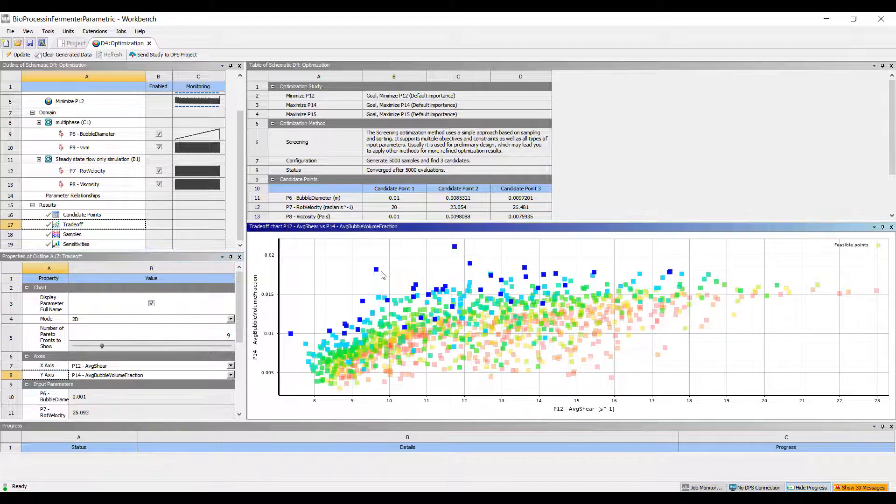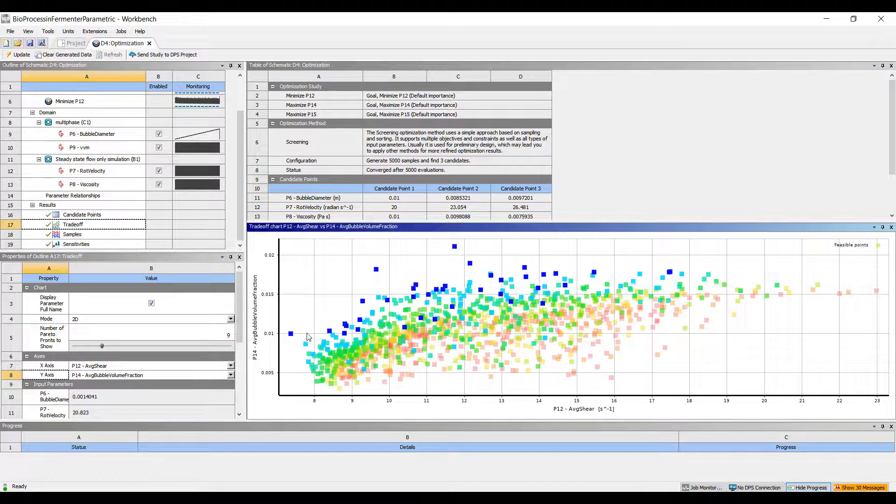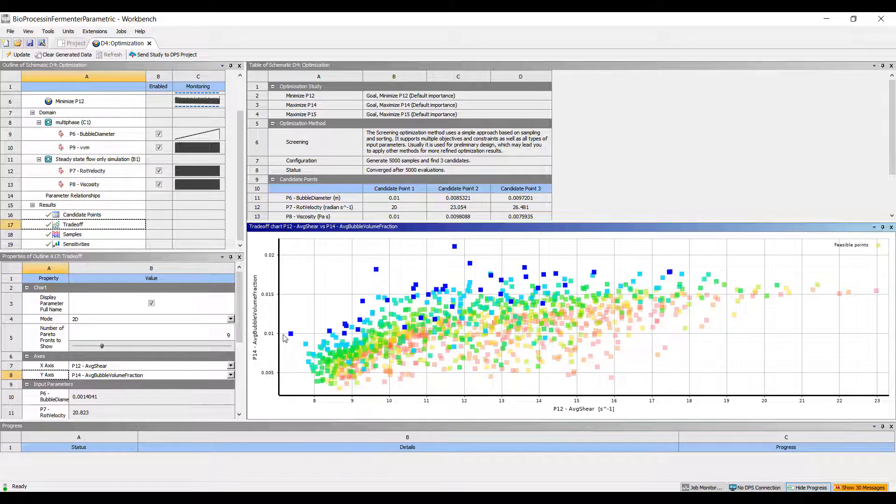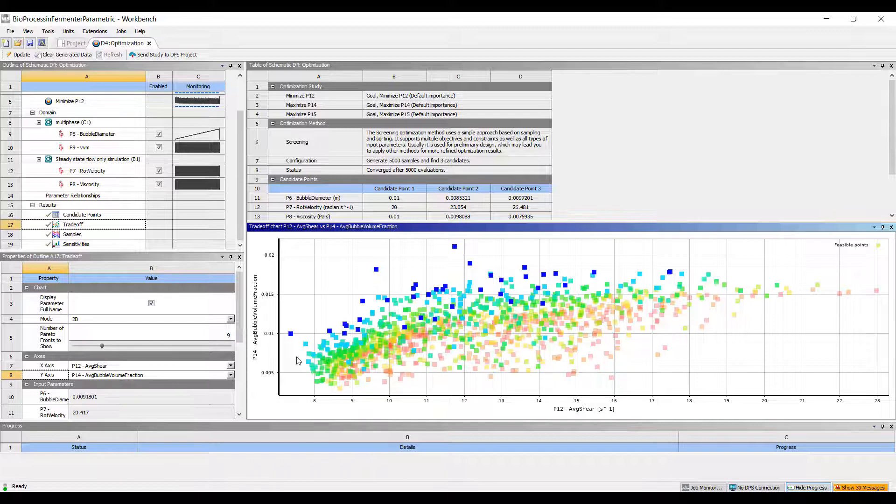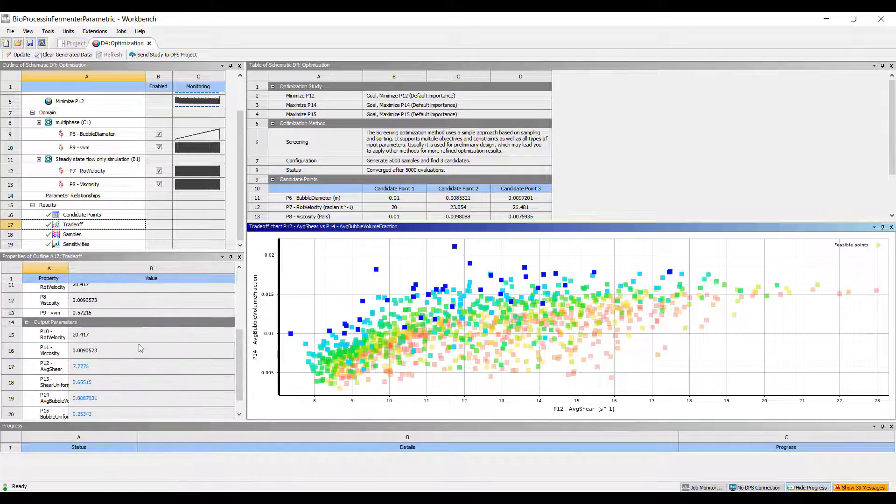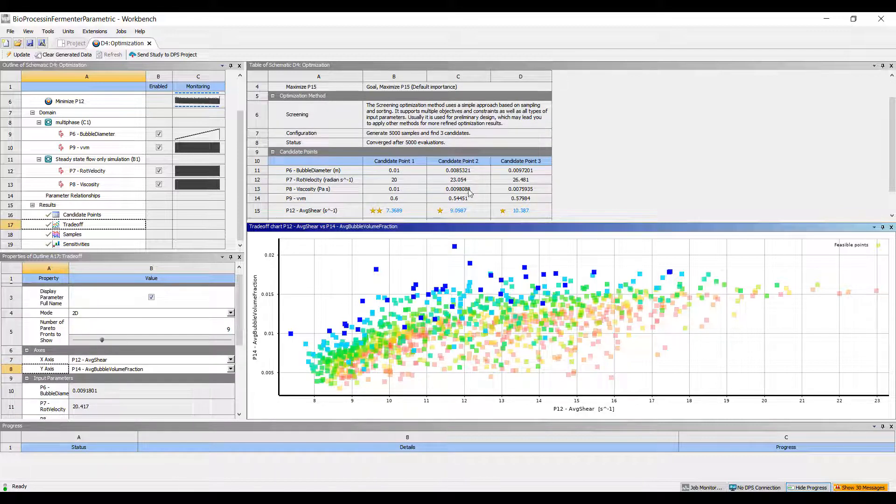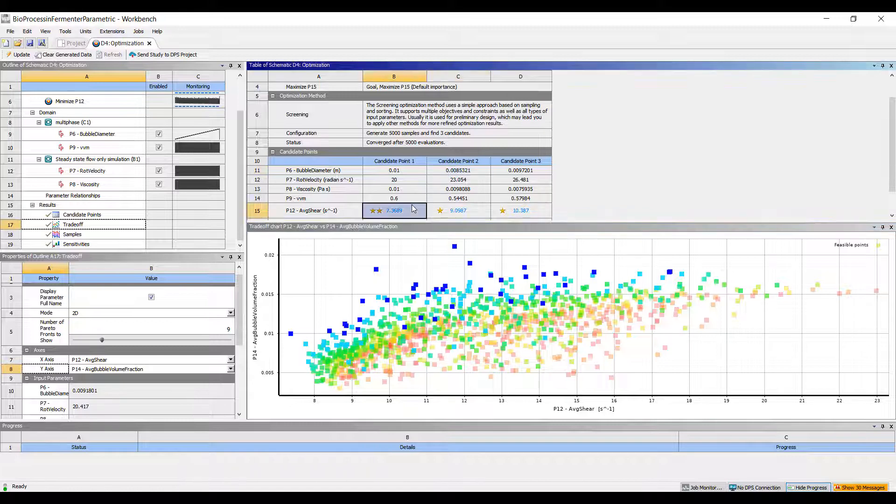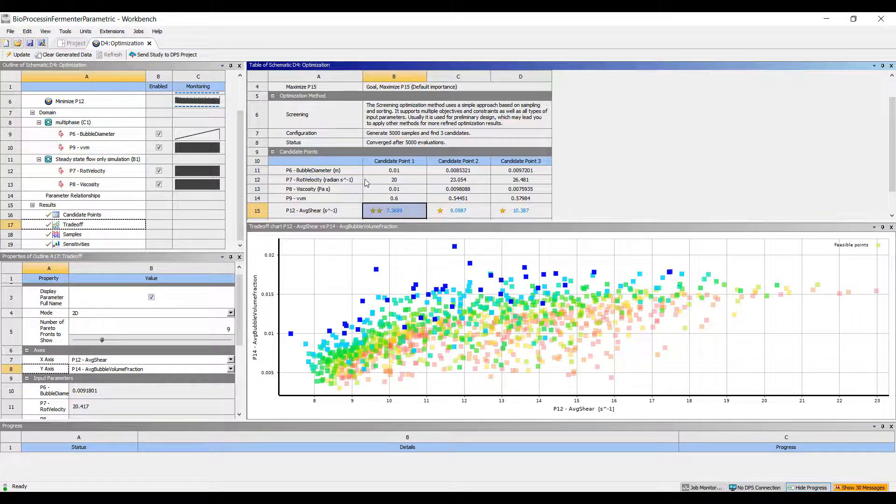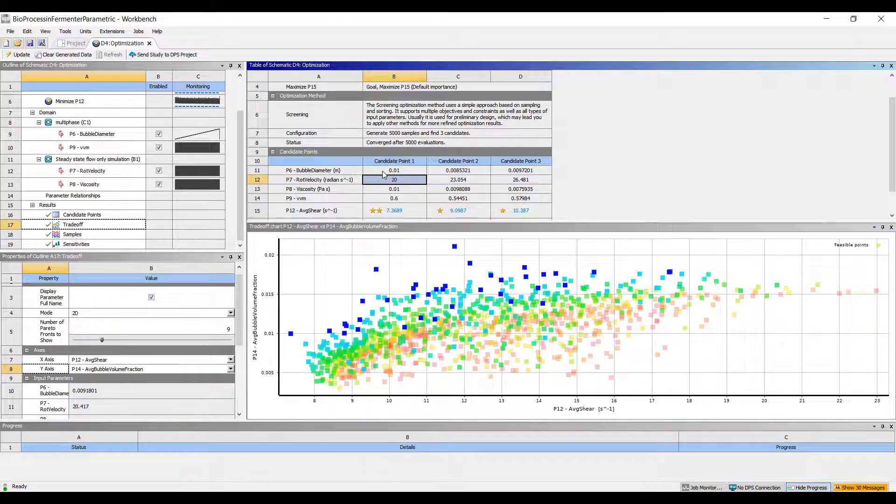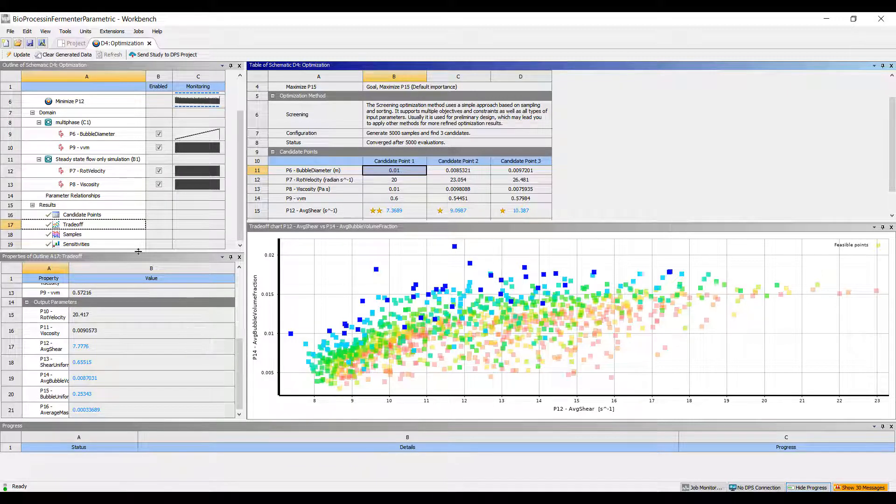If we click on any of these candidate points, it will provide us with an idea of the settings we need to achieve that.